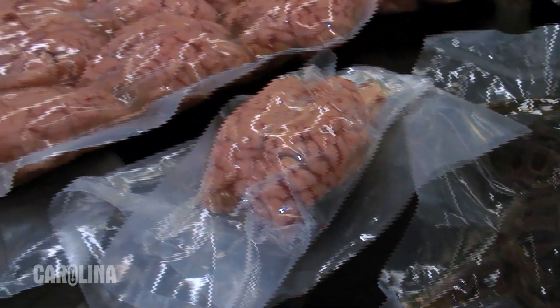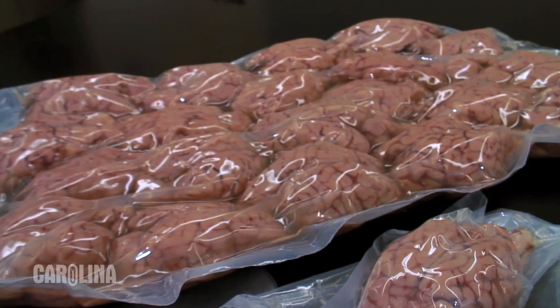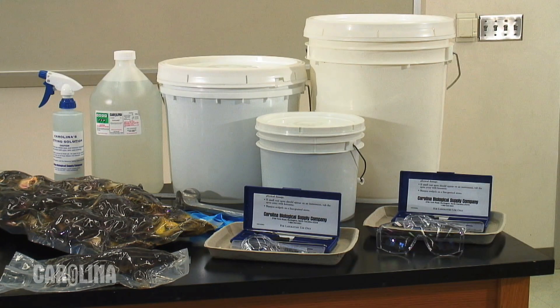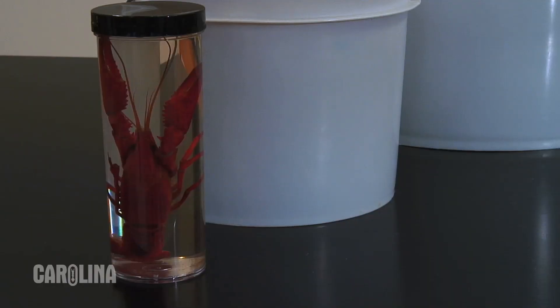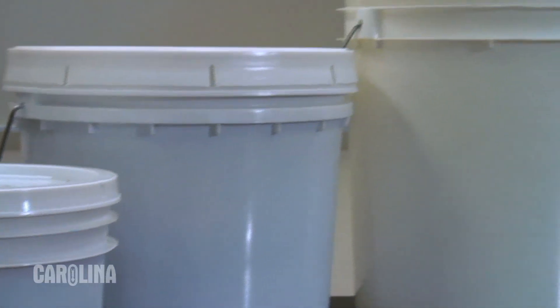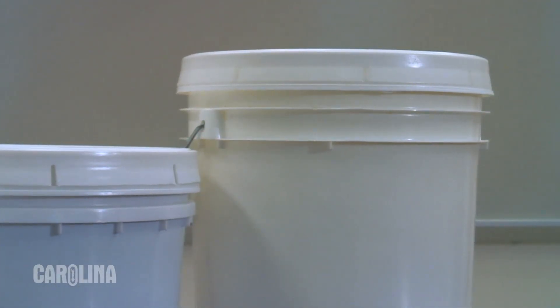Vacuum-packed specimens are supplied in vacuum-sealed, triple-layered plastic barrier bags. The specimens may be packaged one per bag or many per bag, in what's called a bulk bag. Pail-packed specimens are ideal for long-term storage as the specimens are fully immersed in preservation fluid. The specimens are available in one to five gallon pails, sealed with leak-proof, reusable lids.